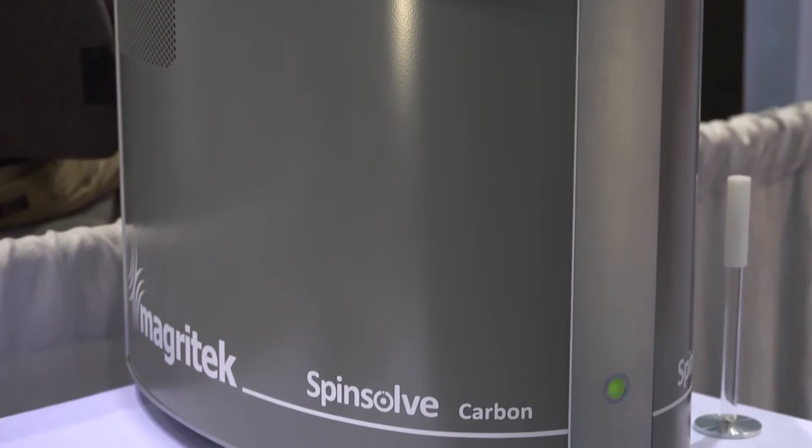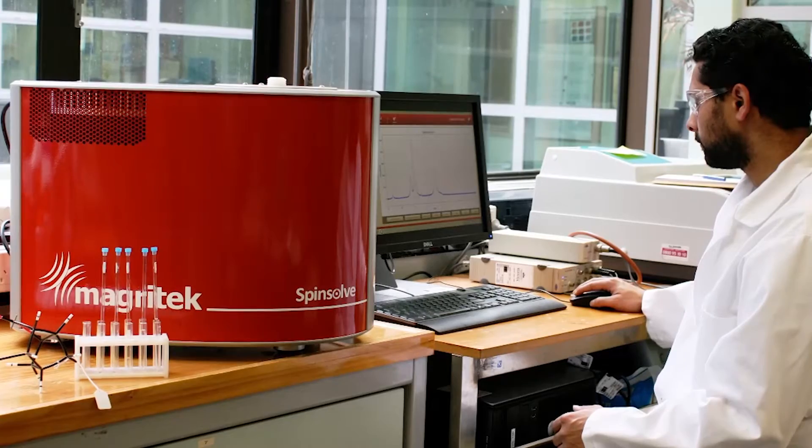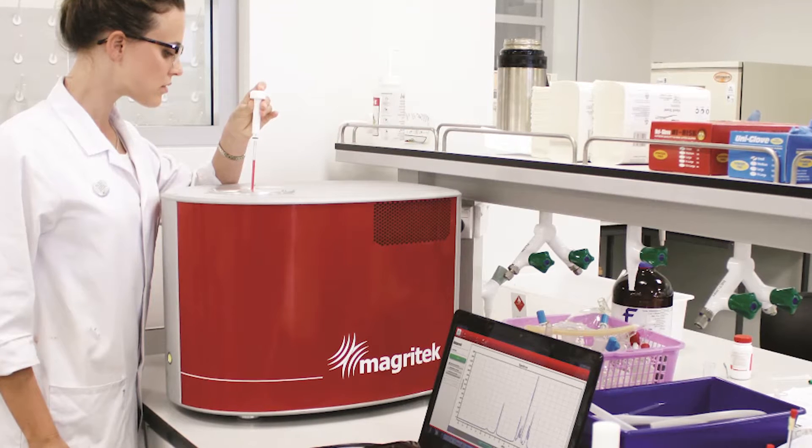My name is Andrew Coy from Magritek. Magritek is a company that specializes in benchtop compact NMR spectrometers. We're here at PittCon today to show our range of SpinSolve benchtop NMR spectrometers and introduce the brand new SpinSolve Carbon addition to the family. SpinSolve is a unique analytical instrument that enables the power of high-resolution NMR spectroscopy to be used in a regular chemistry lab.